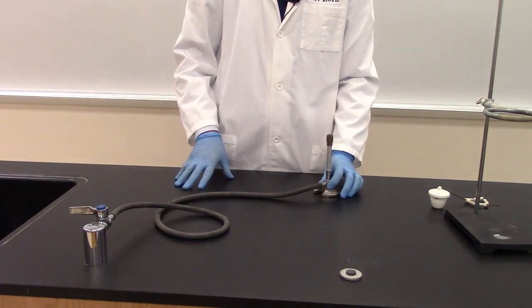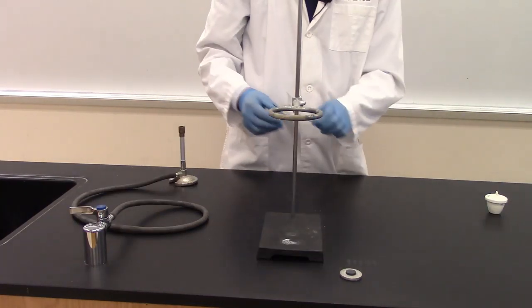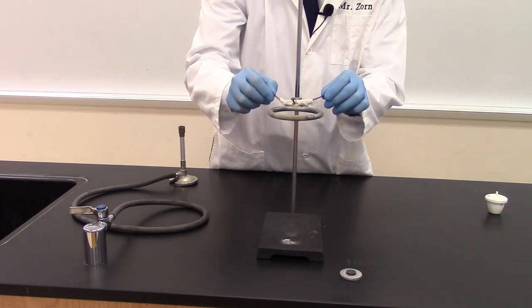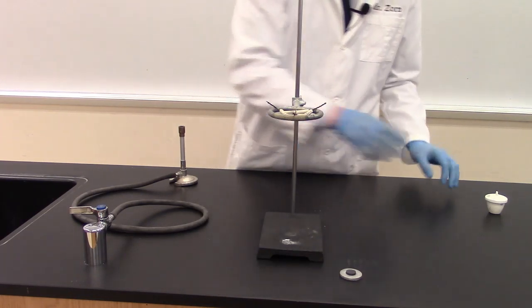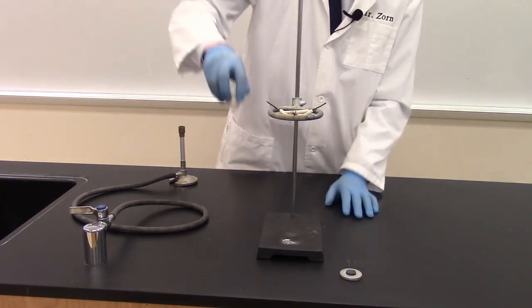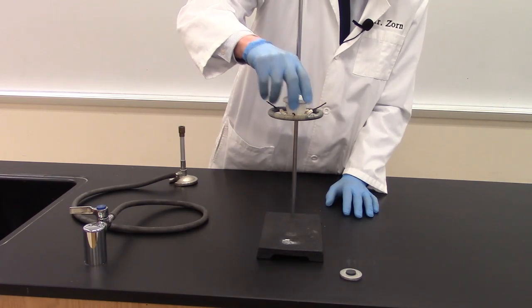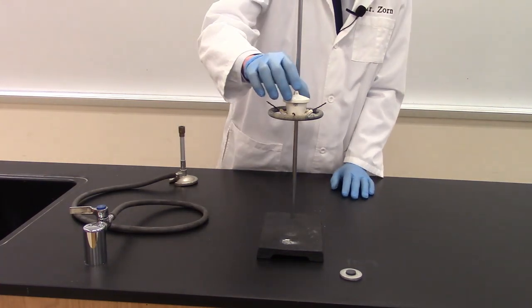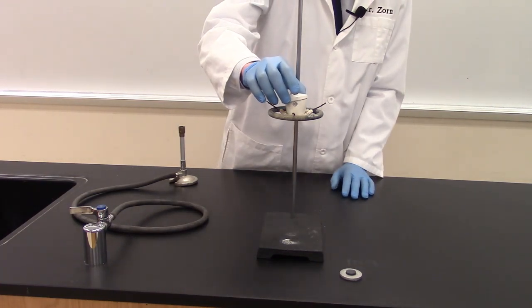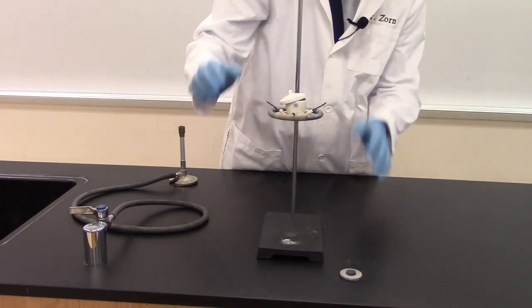Alright, we are good to go. My next step is to take our clay triangle here and we're going to place this on top of the ring. This is going to give us an area to place our crucible like that and then we're going to tilt the lid slightly so any gas can escape during the lab.